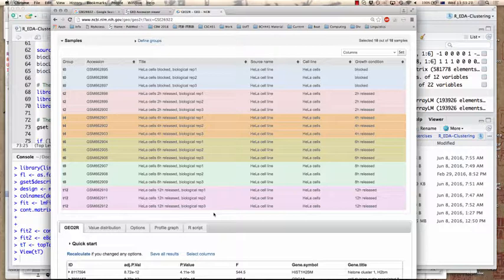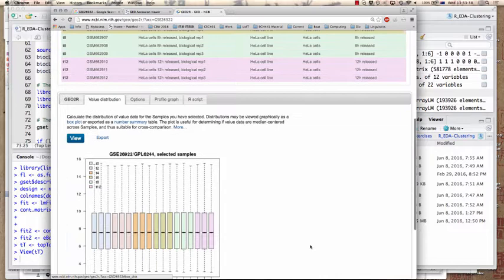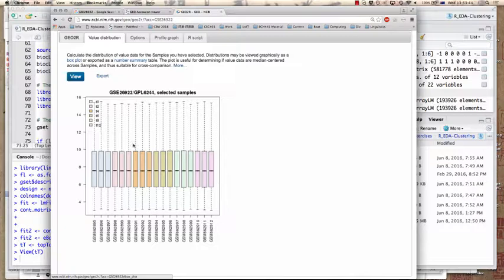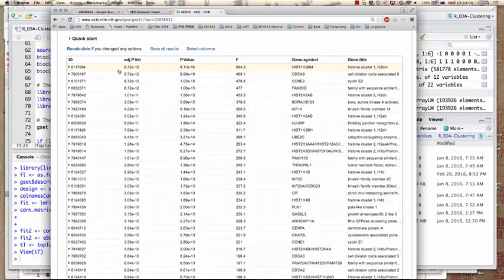Geo2R is a tool that allows you to find differentially expressed genes in microarray datasets. Using their web interface, you define groups and first look at the value distribution. What you expect is that the means are all the same and the variances are approximately the same, so there should not be any outliers. This is a nicely normalized dataset for biological analysis. You can then run a script which gives you the most significant differentially expressed genes.